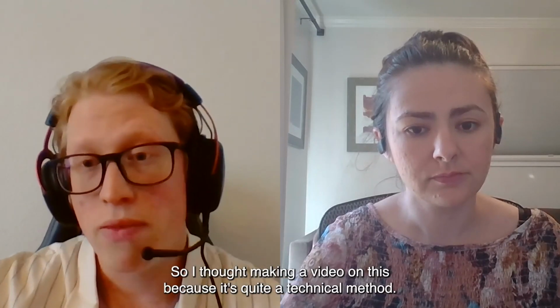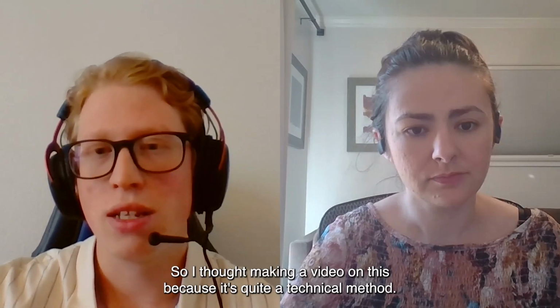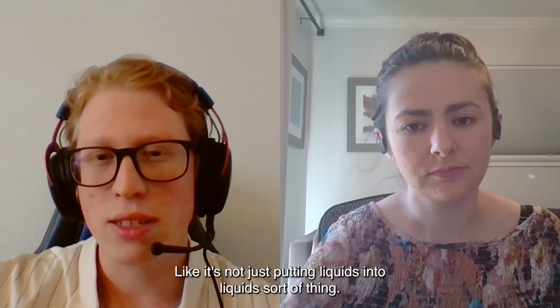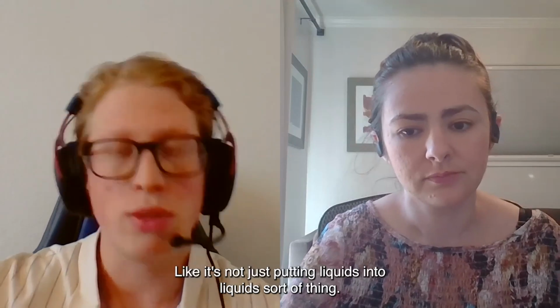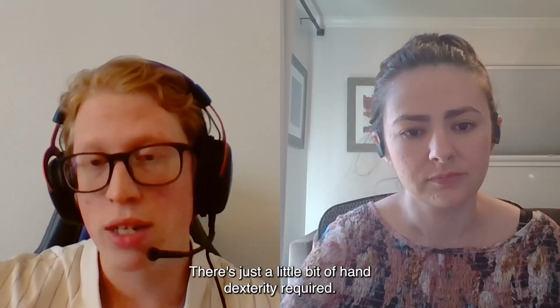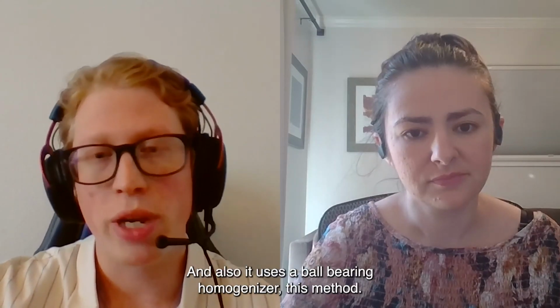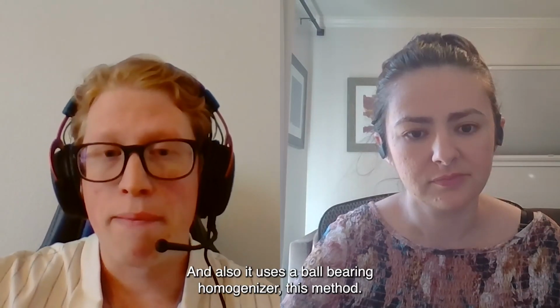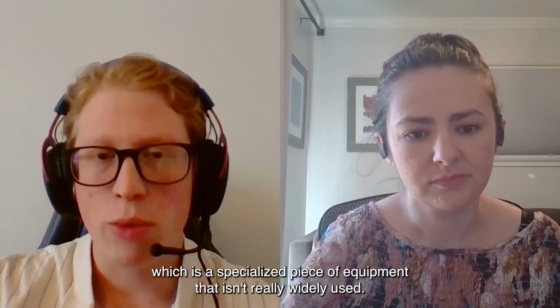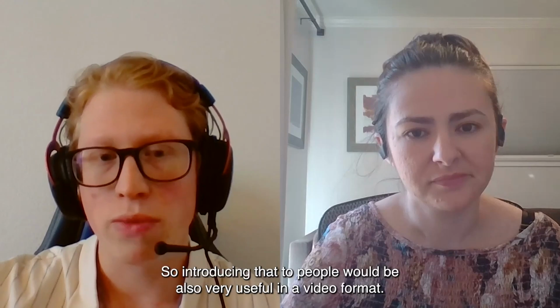So I thought making a video on this would be good, because it's quite a technical method. It's not just putting liquids into liquids sort of thing. There's a little bit of hand dexterity required. And also this method uses a ball bearing homogenizer, which is a specialized piece of equipment that isn't really widely used. So introducing that to people would also be very useful in a video format.